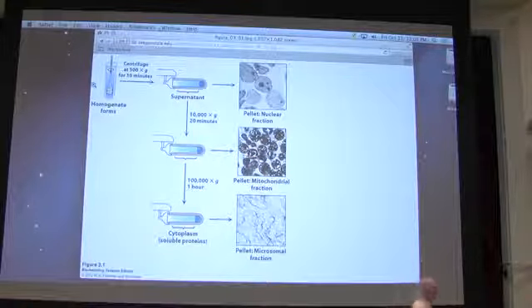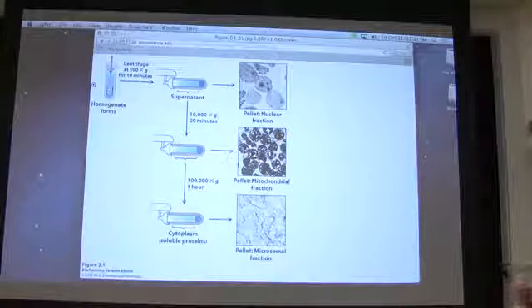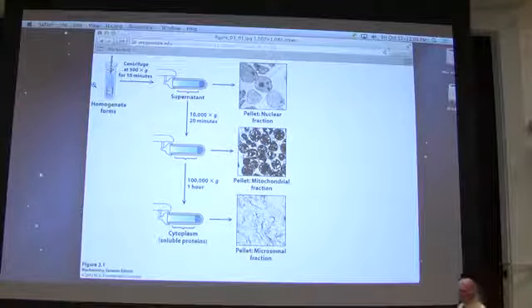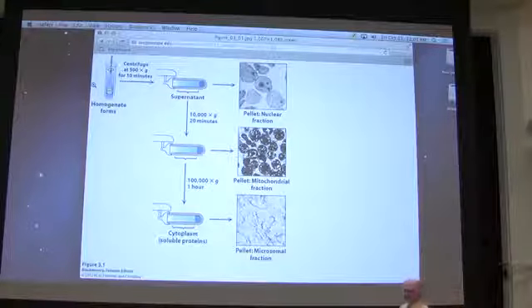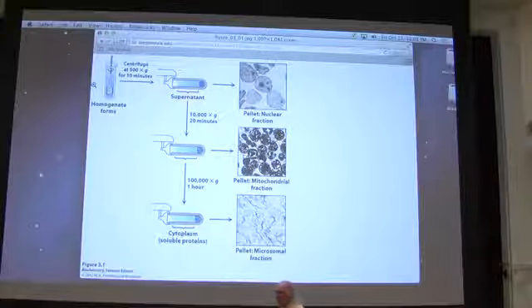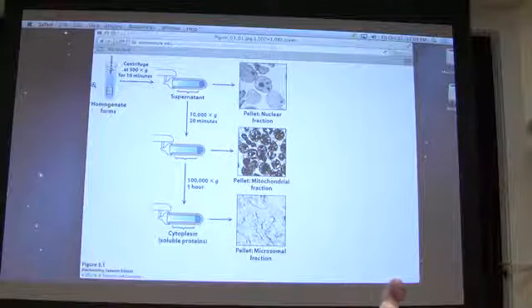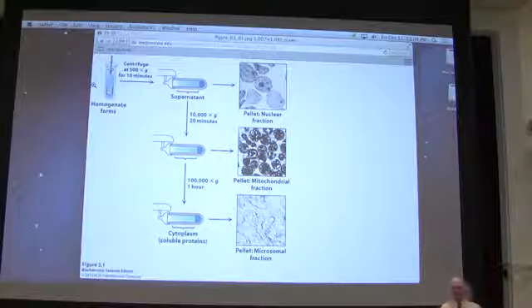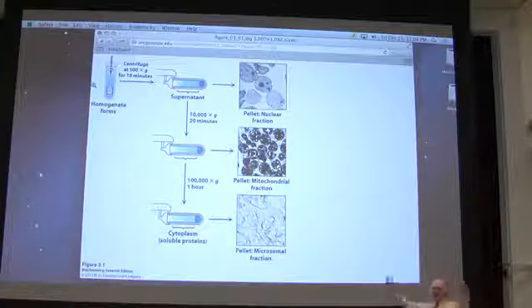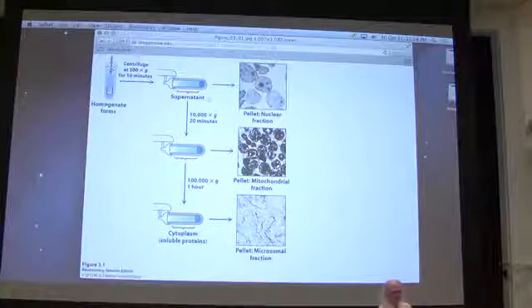We've taken a bunch of cells, and the first step in isolating anything is busting open the cells. There are numerous ways of busting open the cells. We can sonicate them. We can, in some cases, treat them with enzymes. In some cases, we might simply use high pressure. And this particular method right here involves mechanical agitation. It doesn't really matter. All right? First thing we do is bust open the cells. When we bust open the cells, we've got the contents of everything that's in that cell in that tube that we're starting with. You can see that here.